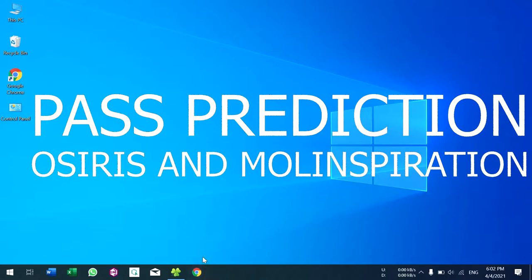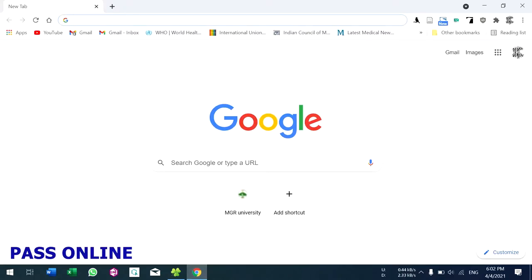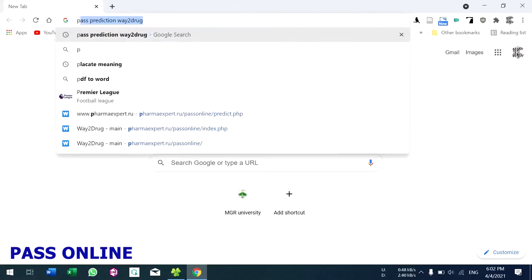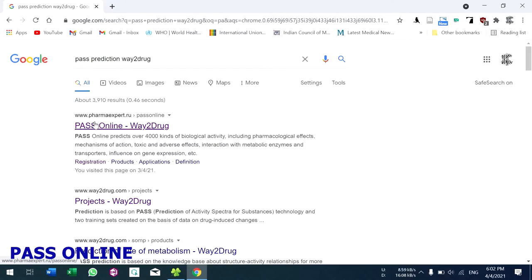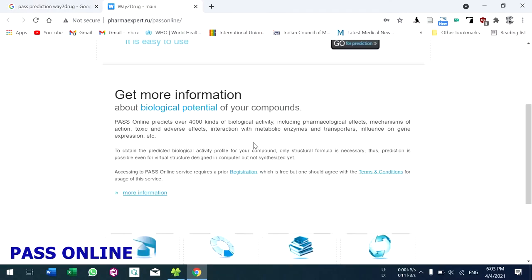Hello all, welcome everyone. Now we are going to see how to use the PASS prediction. First, go to Google search and type 'PASS prediction WAY to drug it'. This is the link you want to go to — either this one or this one. Go to this link. PASS prediction is used to predict biological activity.